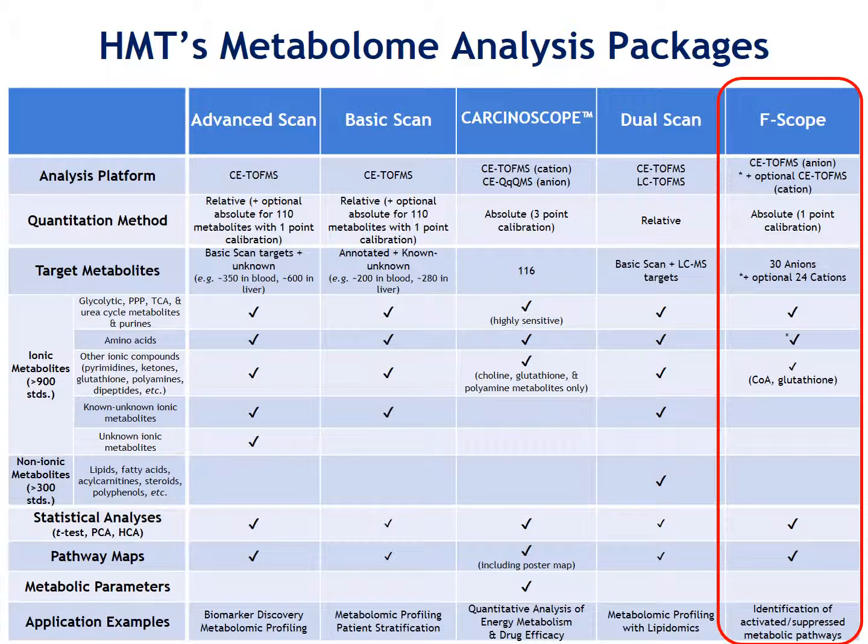For glycolysis, lactate, the final product, is considered as an indicator of glycolytic output. But information from steady-state metabolic levels is limited because it reveals only the balance between production and consumption. Labeling analysis using 13C glucose can quantify the production derived from glucose, which is a direct indicator of pathway activity. Heavy isotope analyses can also often be used to distinguish between multiple enzymatic reactions that result in the same product.